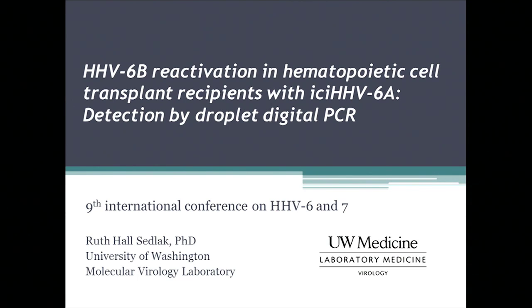Hello, good afternoon. My name is Ruth Sedlak. I am from the University of Washington, the Molecular Clinical Virology Laboratory. I work with Keith Jerome and our collaborators at the Fred Hutchinson Cancer Research Institute. Today I'd like to tell you about a new assay we've developed for the detection of both HHV-6A and B integrations by droplet digital PCR.